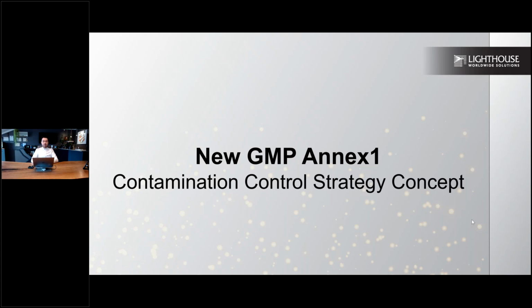In this webinar, we will be covering the new GMP Annex 1 Contamination Control Strategy document, and I will be giving you some examples along with viable and non-viable monitoring details together with this new Annex 1.